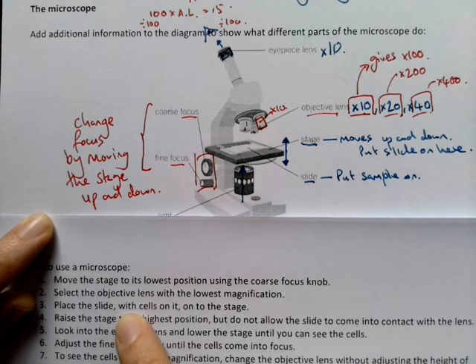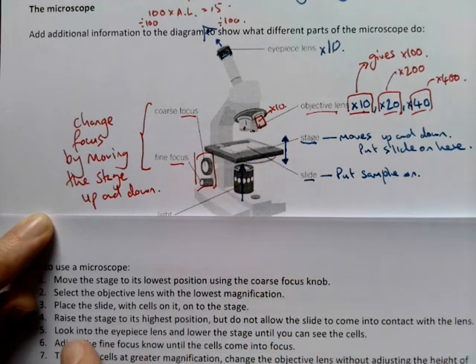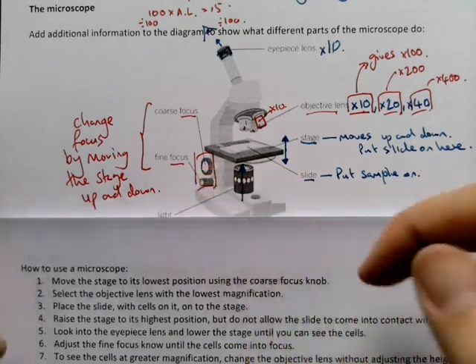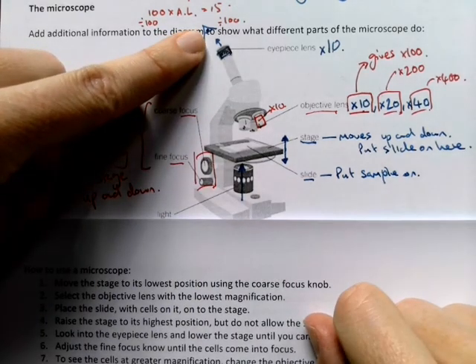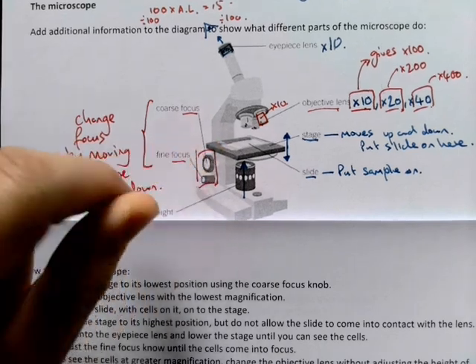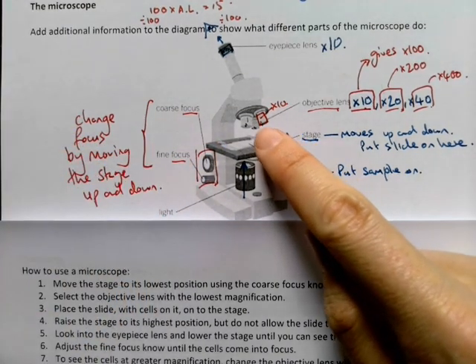Number three, place the slide with cells on it onto the stage. So it goes on, and you can use these clips to hold it on. Number four, raise the stage to its highest position, but do not allow the slide to come into contact with the lens. So now use the coarse focus to raise it up, and you don't even look through the eyepiece at this point. You put the slide on and look at it from the side as you twist this knob to get it up as high as it will go without touching the lens.